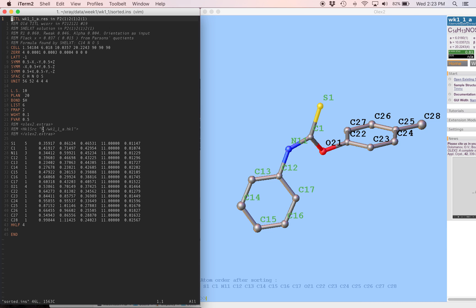But we're going to come back later on in the future and learn how to set that up exactly the way we want it. But for now, this is a good start, and we can proceed with making the structure anisotropic, adding hydrogen atoms, and adjusting the weighting scheme. But we've already done that, so we're not going to worry about it again in this video. Thank you.